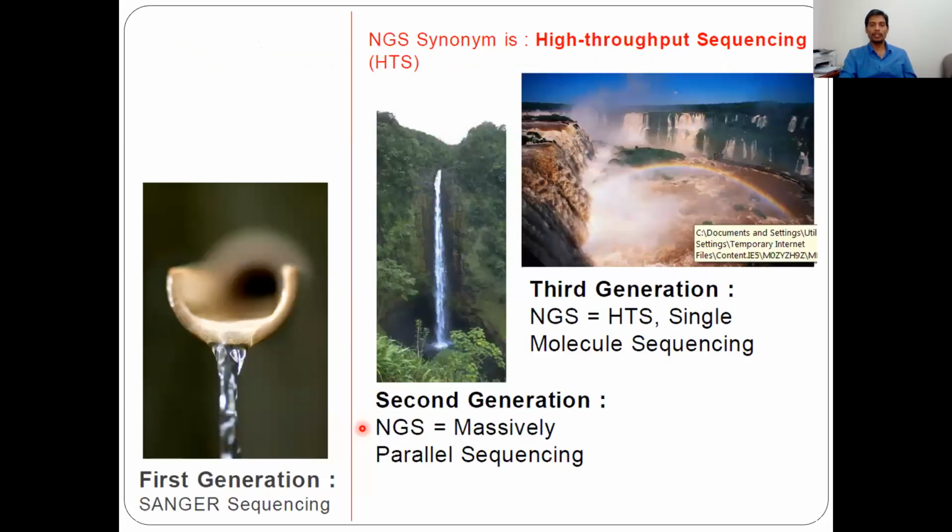So this is the information I want to show. When Sanger sequencing was the only method, until 2006, the sequencing information was flowing like this, and NCBI was collecting all of it. When massively parallel sequencing came, like pyrosequencing, around 2006, and by 2011 or 12, it was like this.